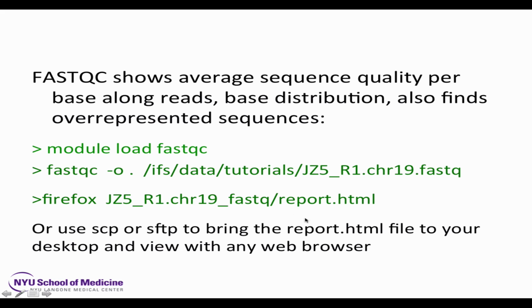But if you want to run FASTQC, we do module load FASTQC. Don't run this like this. I'm going to show you how to put it into a shell script. I don't want you all running it interactively, but this is what you would do interactively, if you were to log into a qlogin shell.